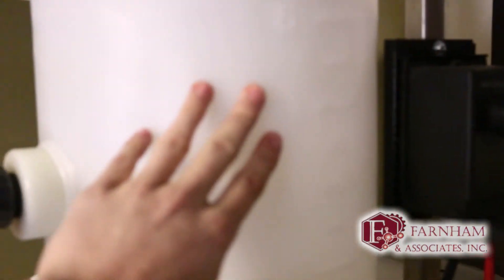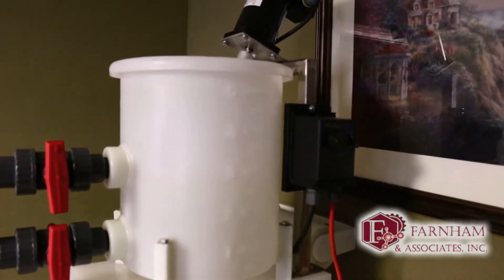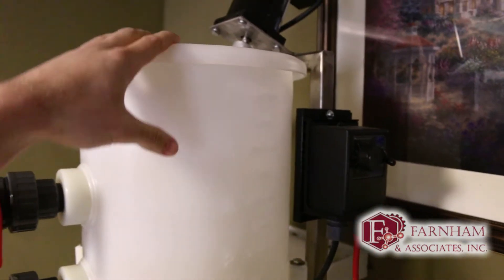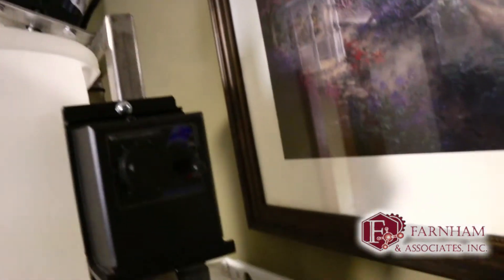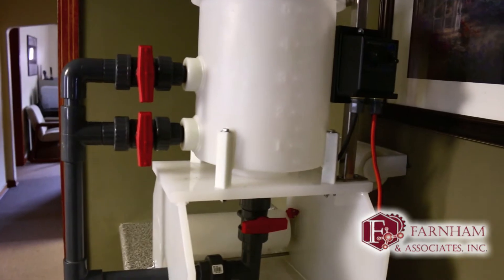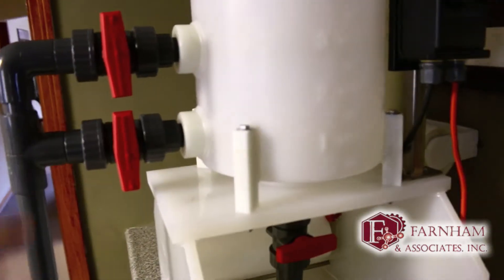Quick rundown on how this works. We've got our mixing tank up here — this is where we're going to add the bentonite clay. It's got a mixer with mixing controls. Typically we're just adding the bentonite by hand today, but from what I understand the full unit will have some type of auger system that dispenses a set dosage amount.